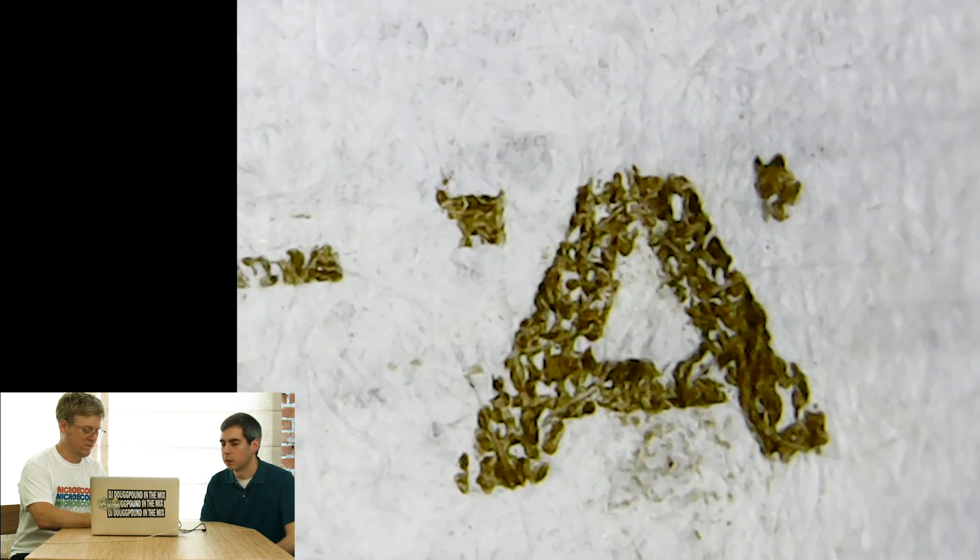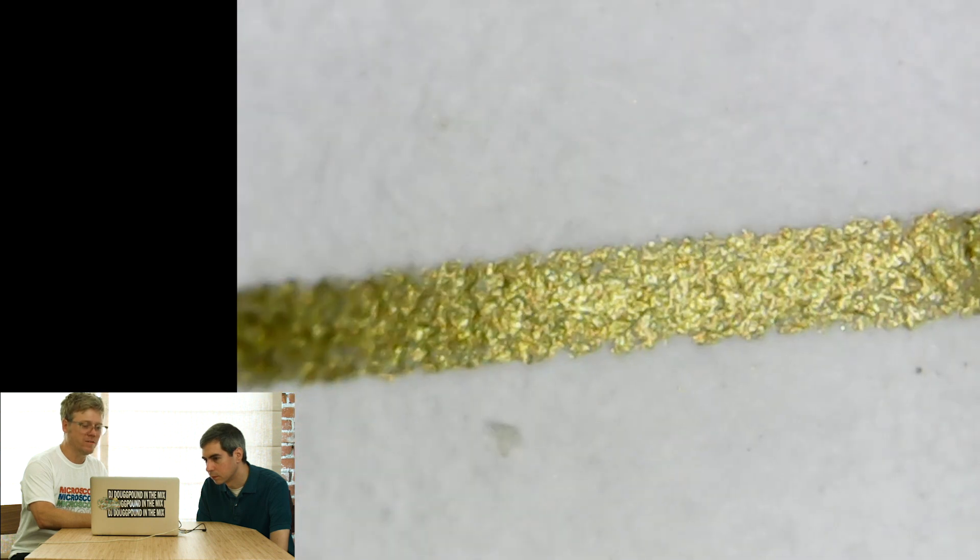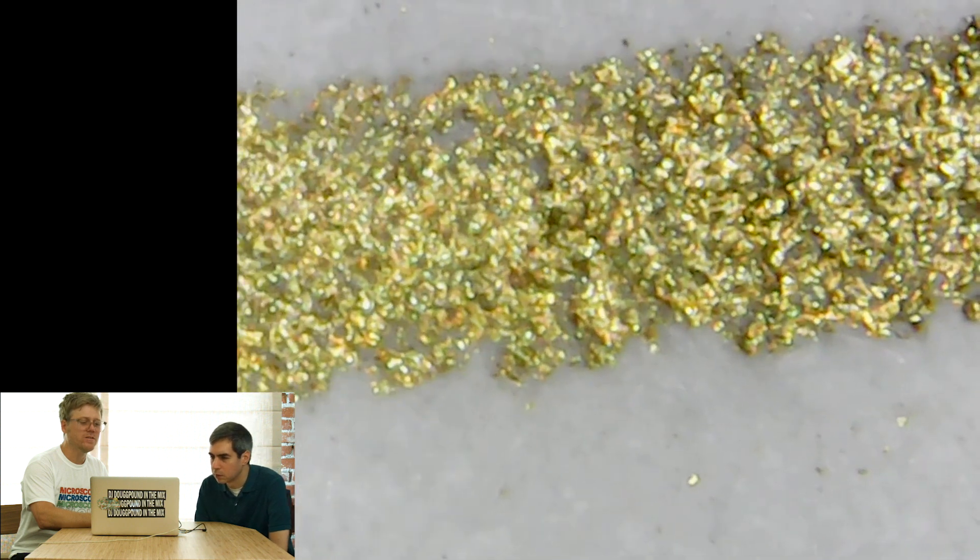Let's look at the print on here first. There's the Export A — A as in quotes, A for apple. On the naked eye it looks like a shiny golden print. Let's go 1000X on there. Oh, beautiful gold. That's gold. Think about that — you're smoking a cigarette and there's beautiful gold right on your lips.